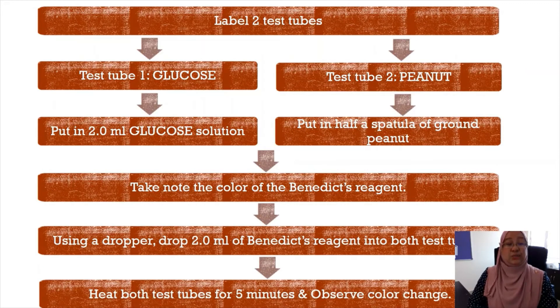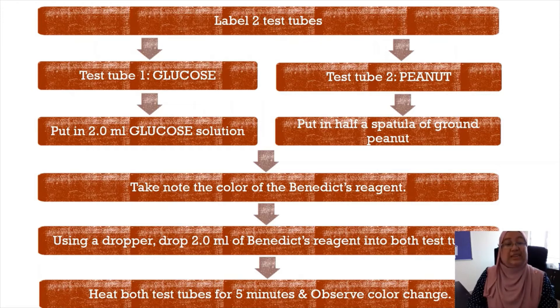This procedure is performed to determine the presence of reducing sugar. Label two test tubes: test tube one for glucose, test tube two for peanut. In test tube one, put in 2 ml of glucose solution. In test tube two, put in half a spatula of ground peanut. Take note of the color of the Benedict's reagent.